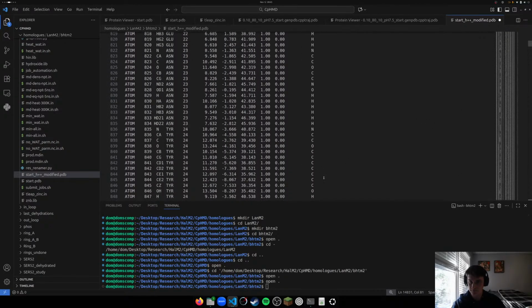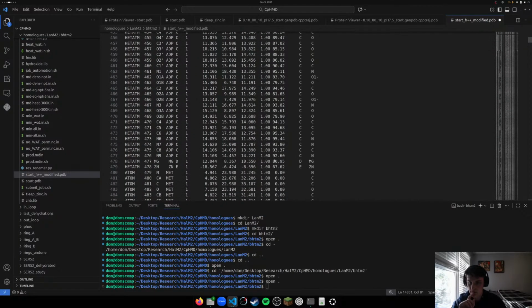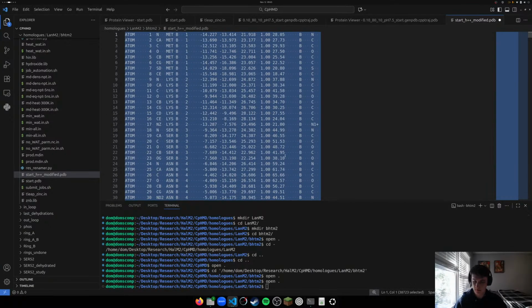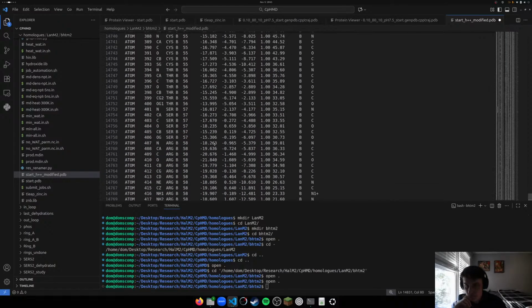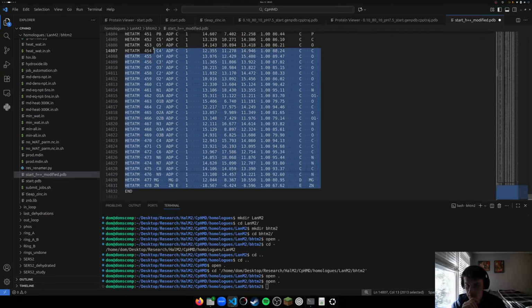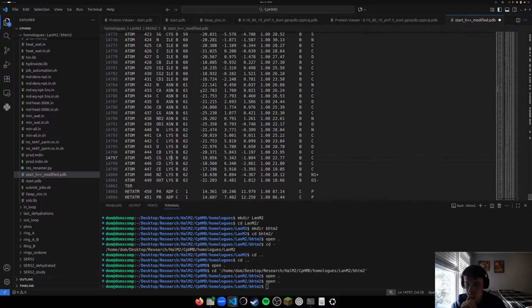Right here. We have our peptide, our zinc, our ADP. So we'll copy that. Place this at the end here. I think, yeah, these come last actually. All right.